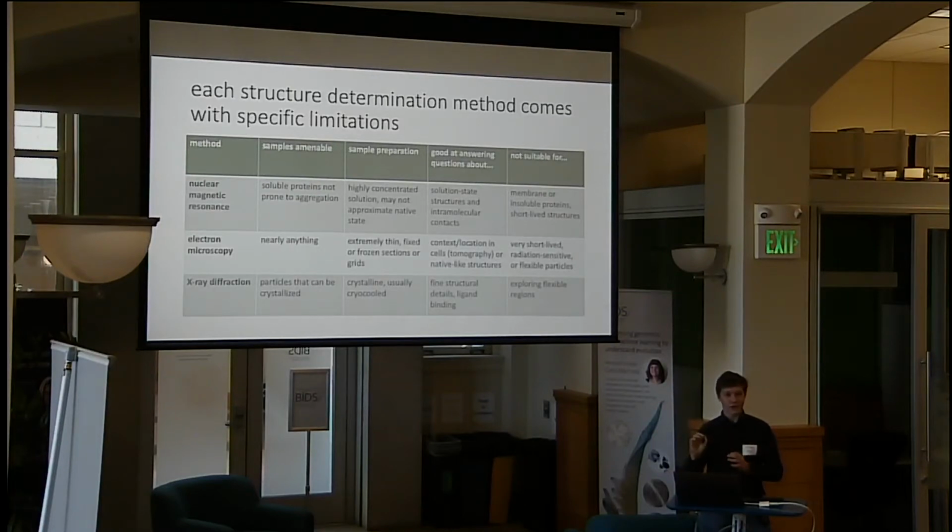Usually we can average out one static structure from all of these instances that are oriented the same way. For electron microscopy, we let everything move around in solution and try to cryofreeze it in vitreous ice as quickly as possible so that we get all the different orientations but frozen, and then we can average together what one structure in very close to native state should look like.